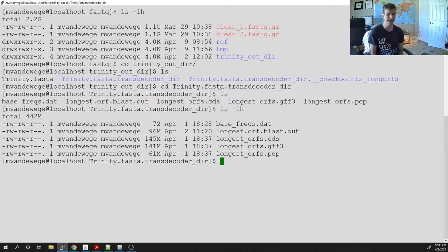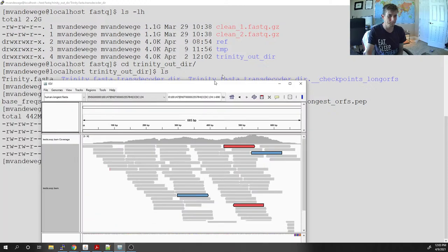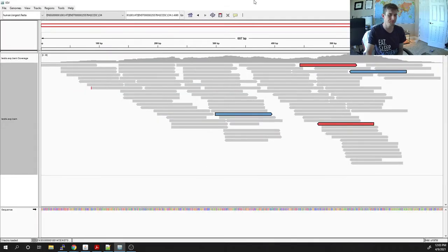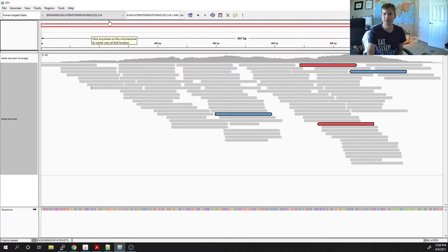I'm going to pull up a program called IGV, made by the Broad. I'm not going to make you all use this — it's just an example so you can visualize what's about to happen. It is a little graphical so it may lag, but this is IGV. What we're looking at is a transcript across the top.